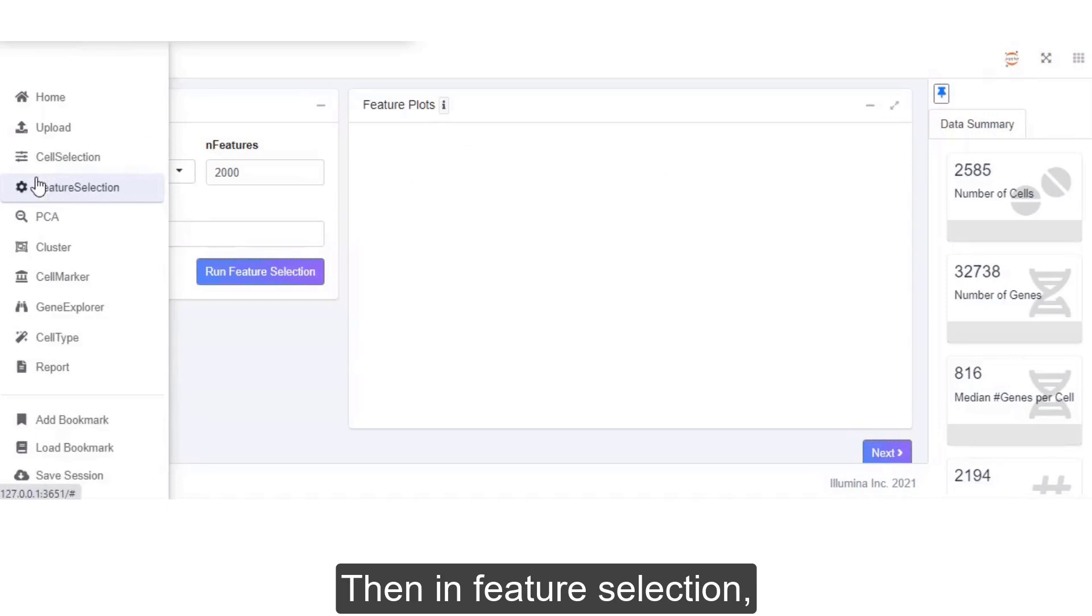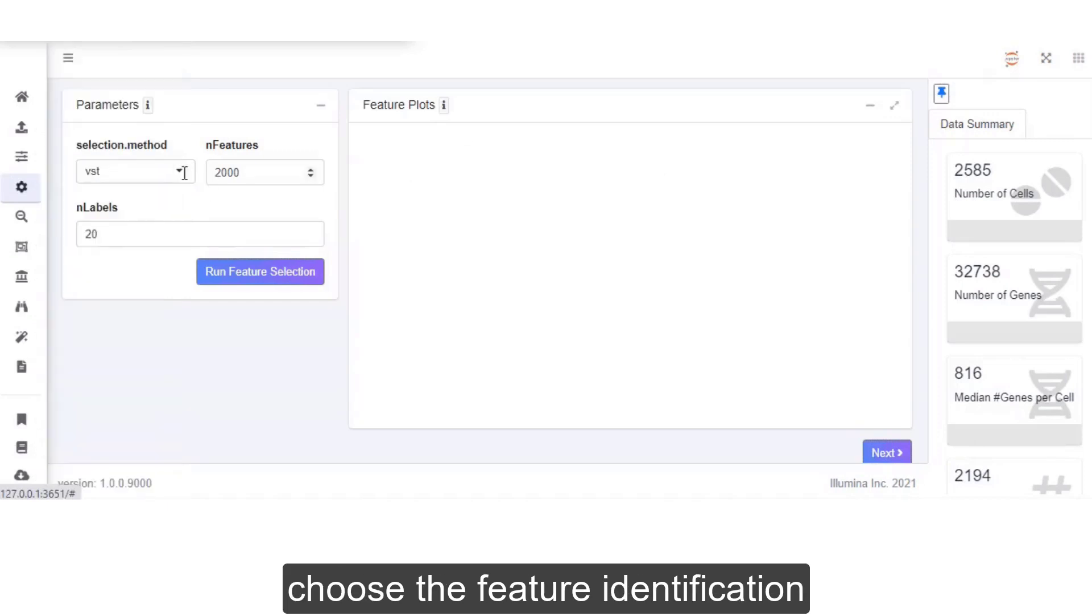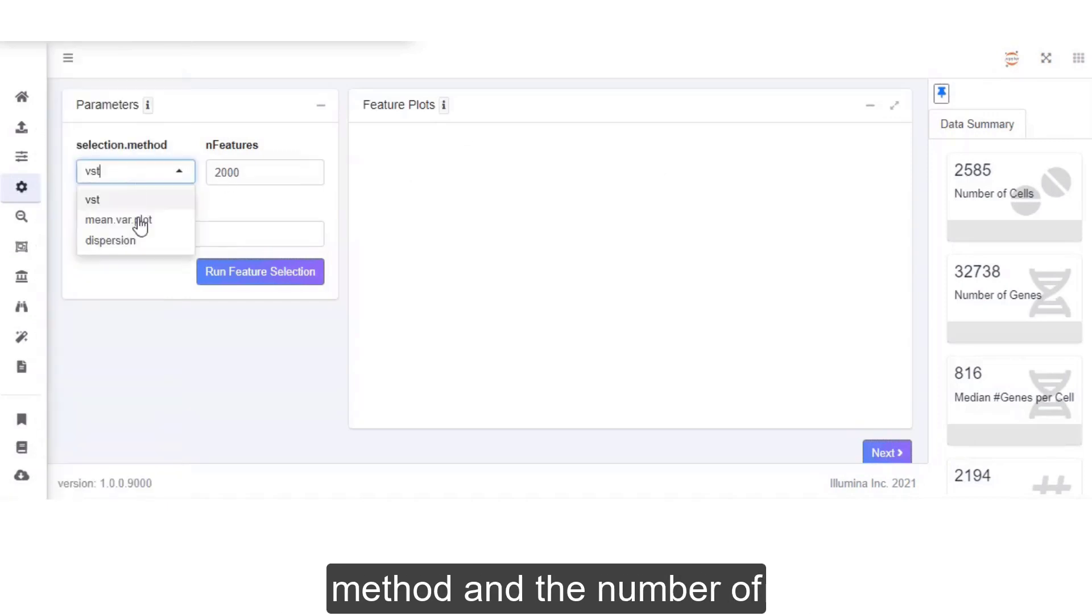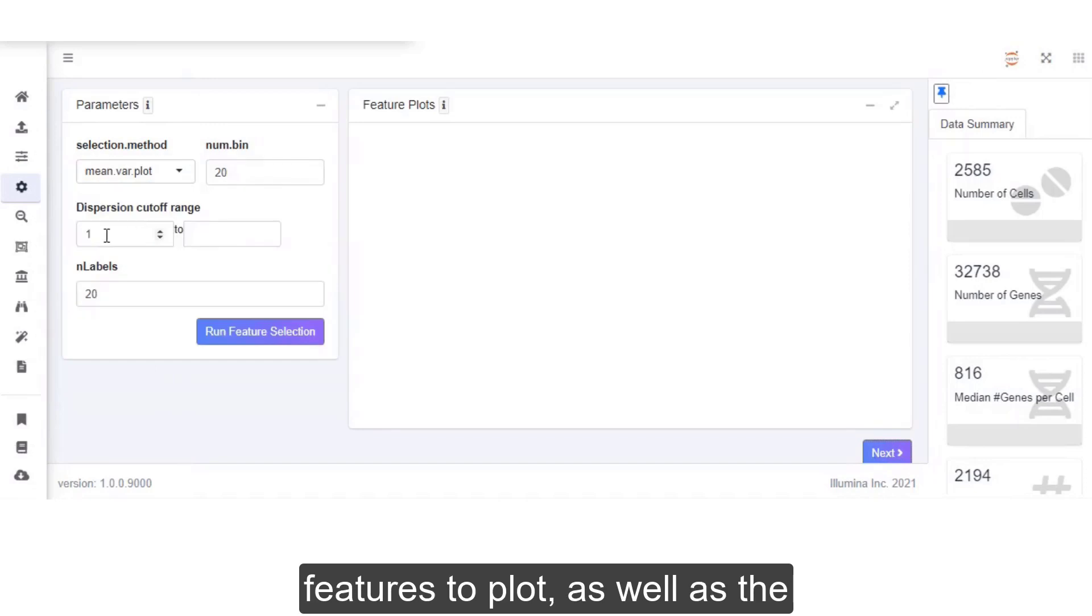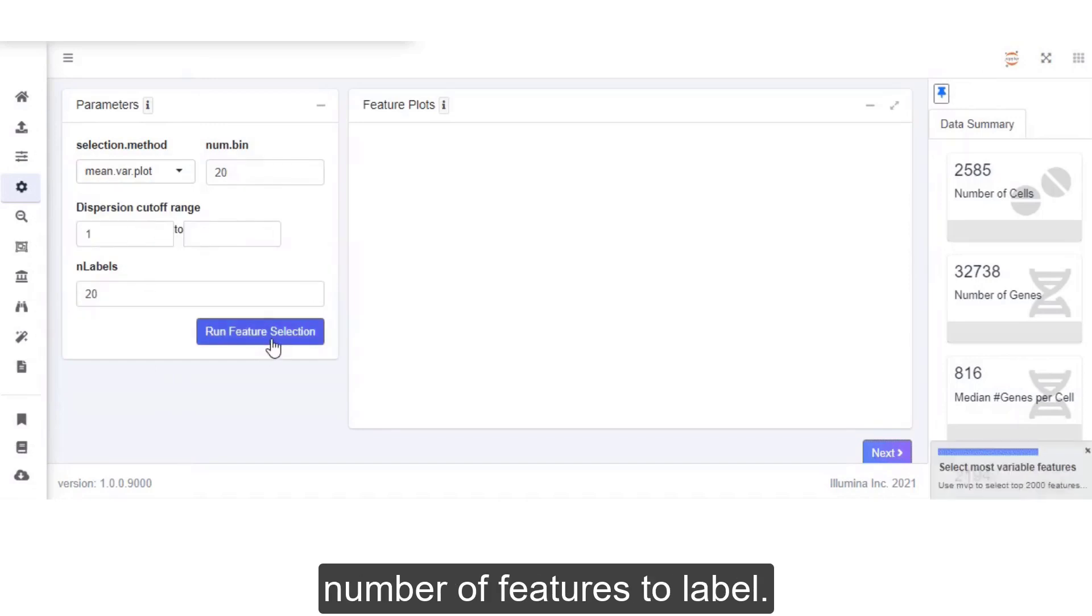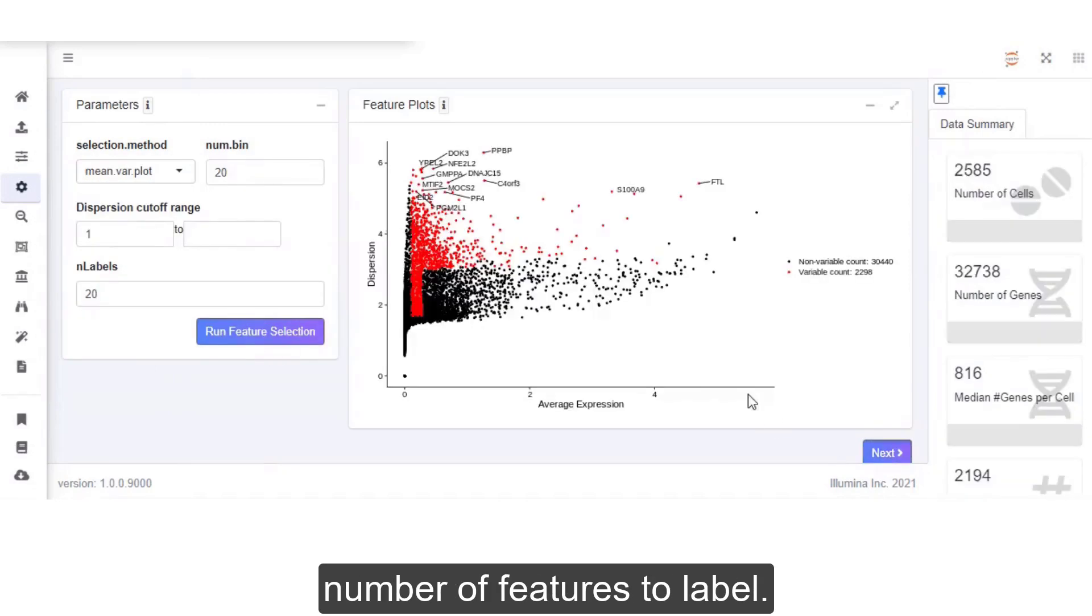Then, in feature selection, choose the feature identification method and the number of features to plot, as well as the number of features to label.